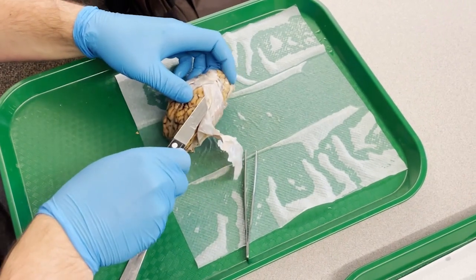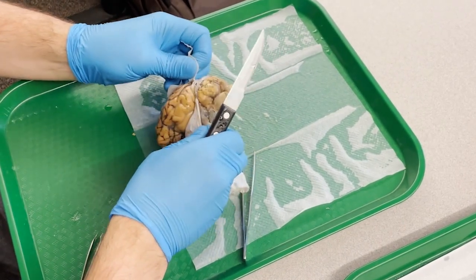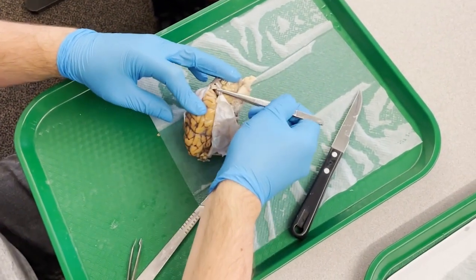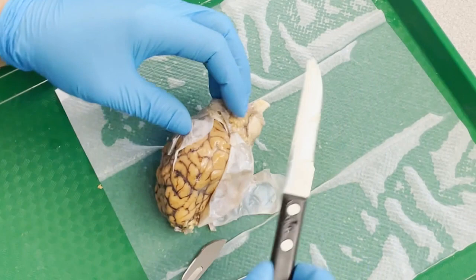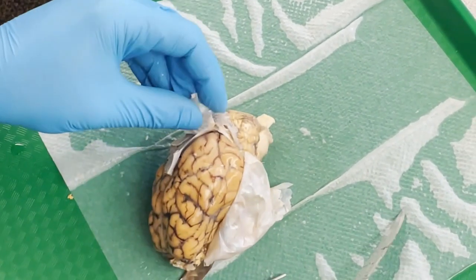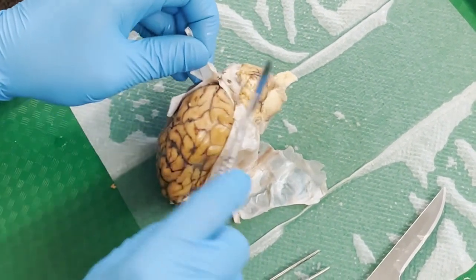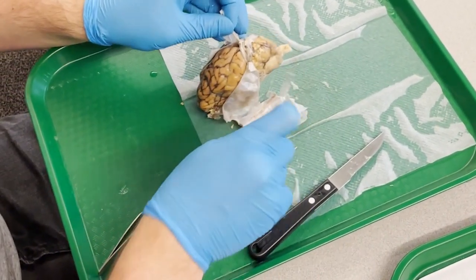We can cut through the back a little bit to liberate it from the more basal parts. And so now we have another piece that's deep inside between the cerebral hemispheres and the cerebellum. I could pull it up, but I have to definitely still cut through it here. It's gonna be a bit tricky. So I will try my best. Knife time. Okay. If you happen to cut into the cerebellum a little bit, it's not the worst thing in the world. Do try to avoid it to the best of your ability, though.